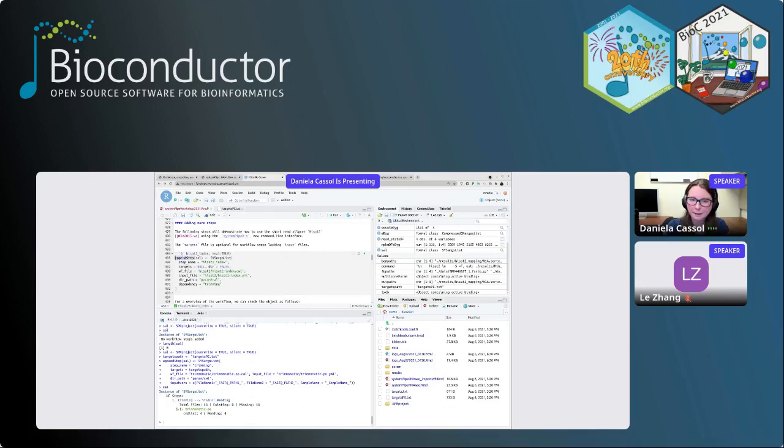The same thing, that will be a command line step. So I have the append step, the sysargs list, and the only two things I would like to highlight here. Number one is the targets for the index. I don't have many samples, it's just one, the reference genome.